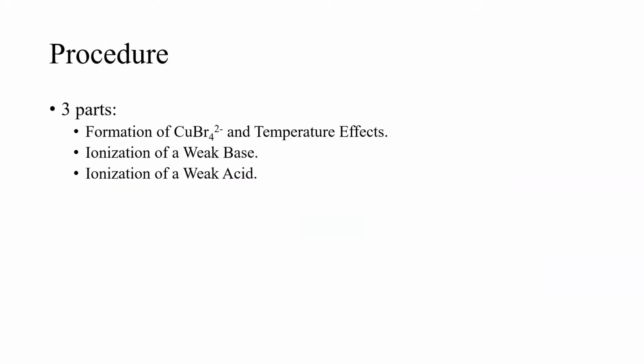So for this lab, you would be demonstrating the principle in 3 parts. The first part would be formation of copper 2 tetrabromide and temperature effects. And part 2 will be ionization of a weak base, and part 3 will be ionization of a weak acid.